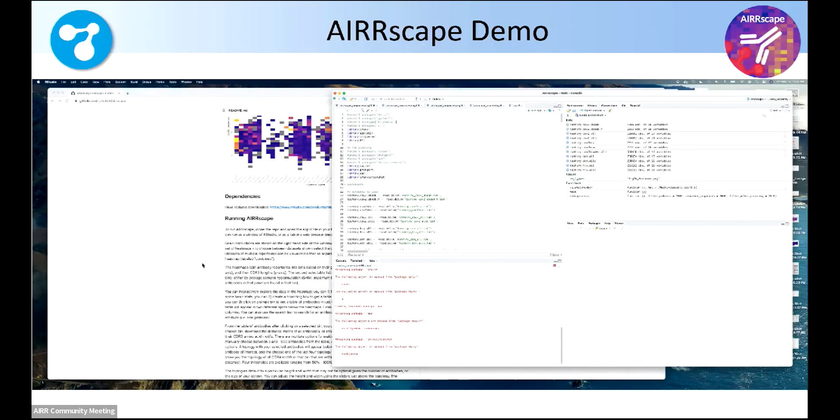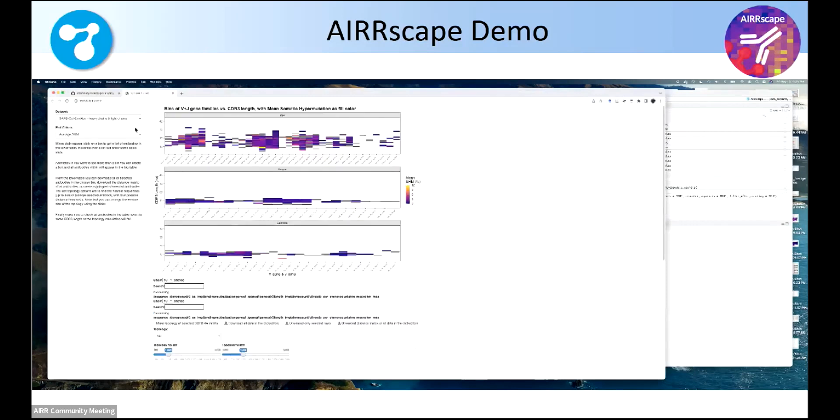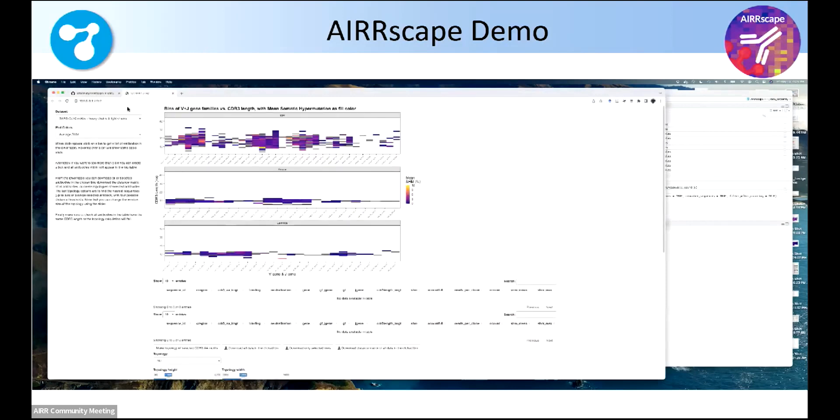So all those tabs are available in the GitHub repo. Some of them include the preprocessing scripts, which let you change any, import any AIRC data set, which is very cool. So this is actually I just clicked the run app, and it's actually loading the shiny tool, and actually all the data sets.